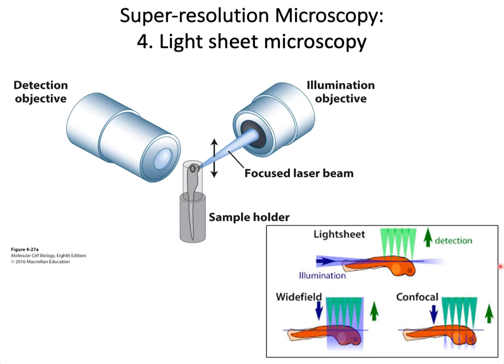As a comparison with the other conventional fluorescence microscopic techniques, in the wide field fluorescence microscope, the whole sample is excited by the excitation wavelength and it emits the emission wavelength to be detected. In point scanning confocal microscopy, each point on the sample is excited individually, and the information of the emission light is also collected individually and later merged together to form the image.